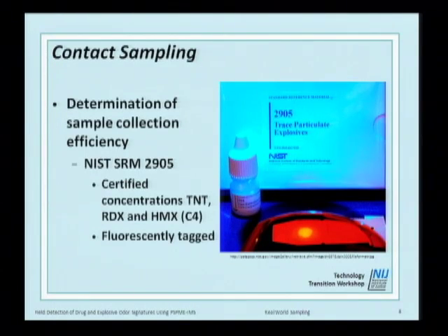Now, besides you seeing it visually, even though, for instance, you might see a faint fluorescence, you can still introduce that into the instrument and you will see a response for the TNT if that's the one you use, or the RDX from C4.